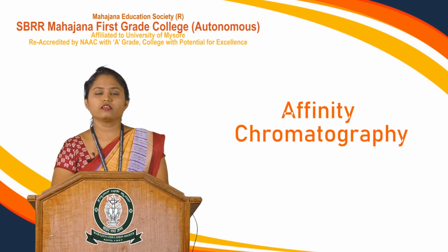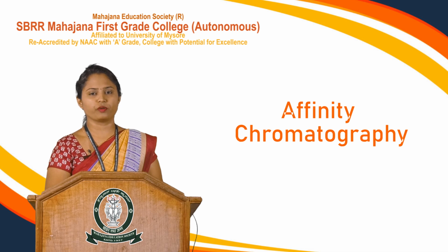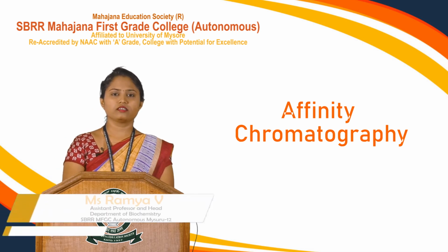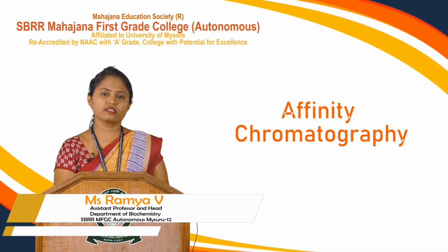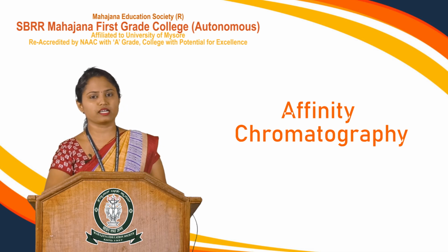So yes students, today we will be discussing one aspect of biochemical techniques, that is affinity chromatography. Before entering into affinity chromatography, as a biochemist you all know that we are dealing with different kinds of biomolecules, right. So biomolecules might be either carbohydrates, proteins, lipids or nucleic acids. Studying all these biomolecules, obviously we require one major step, that is isolation.